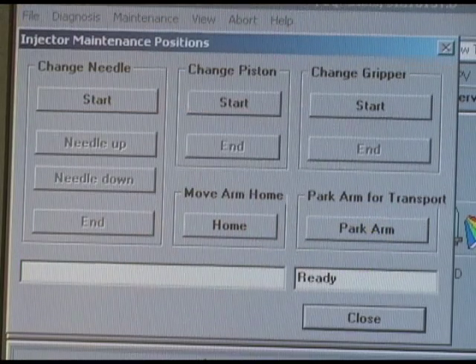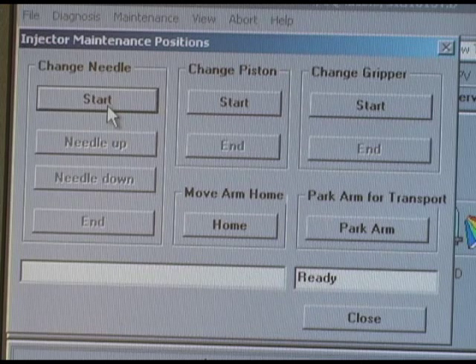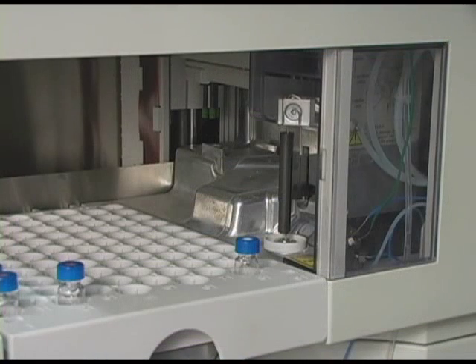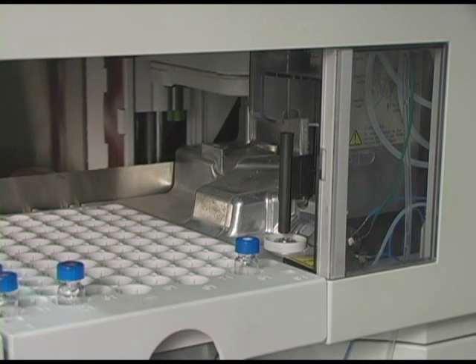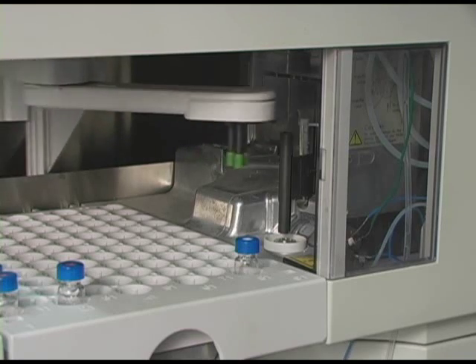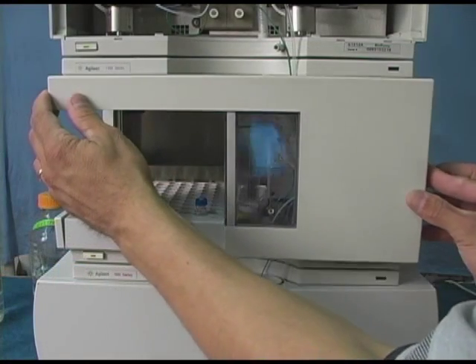The Injector Maintenance Positions pop-up window will appear. From this menu, click on the Start button under the Change Needle header. The Needle Arm will move into the Maintenance Position. Once the Needle Arm has stopped its activation sequence, remove the front cover from the Auto Sampler.